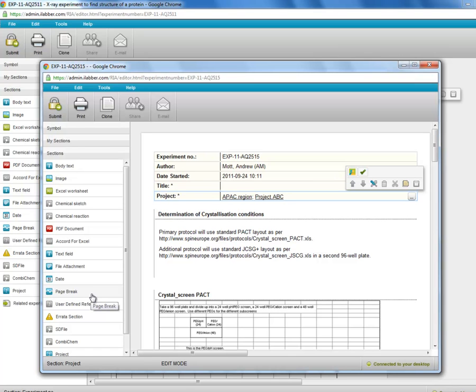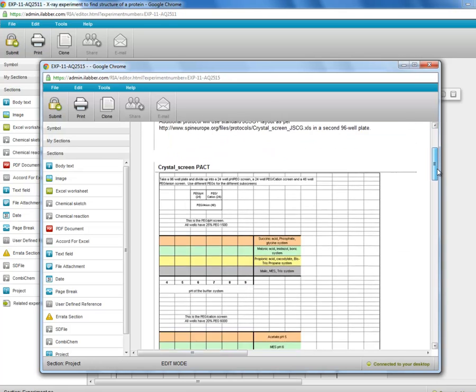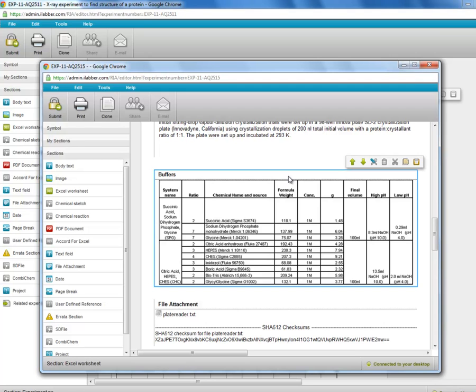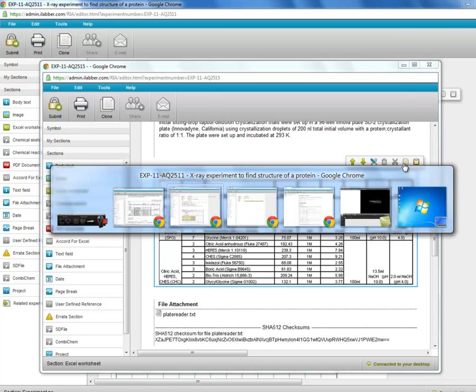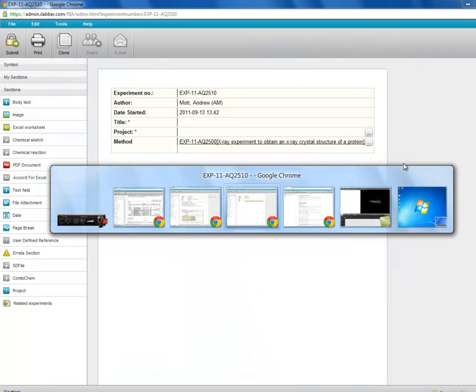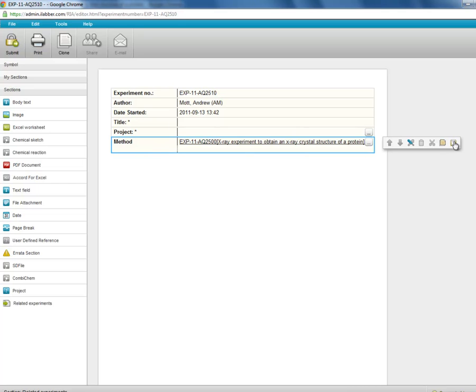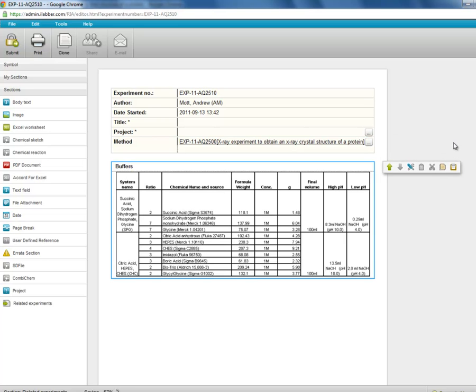Another very powerful feature of iLab is that you can always copy and paste sections either within or between experiments. So I can take a section, for example this section here with an Excel table. I can click on the copy button in the section toolbar. I can go to my other experiment, select the section where I want the new section to be pasted underneath and click on the paste button. And a copy of the other section is now inserted into this experiment.